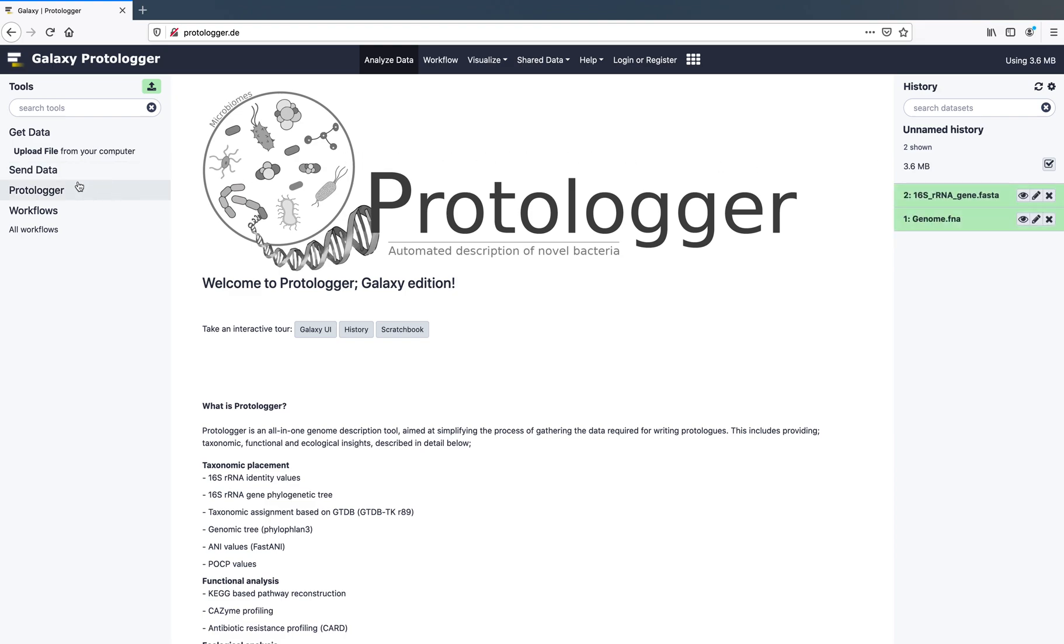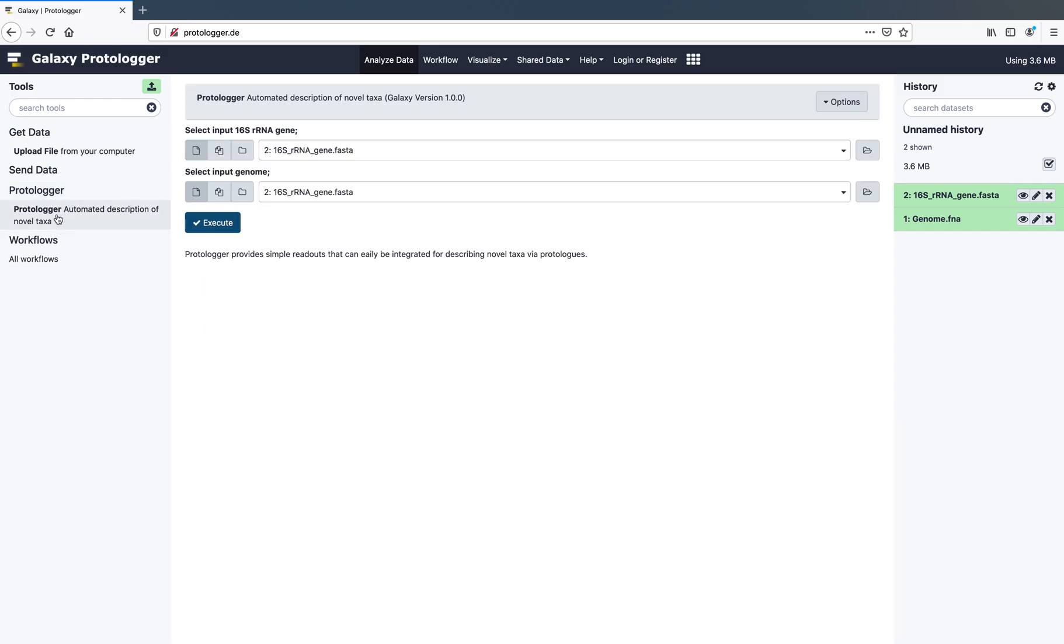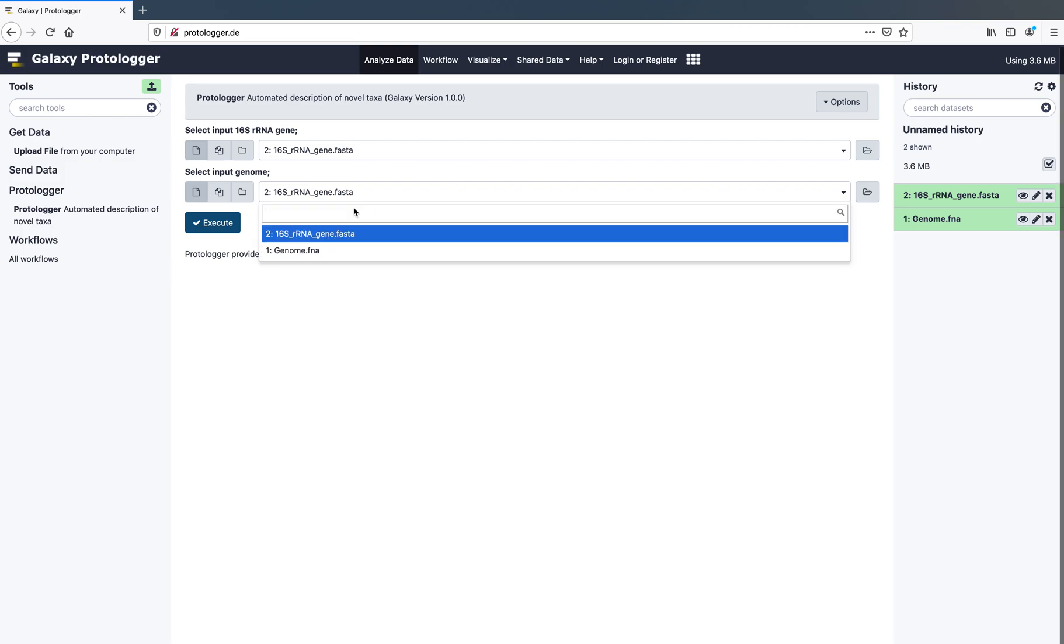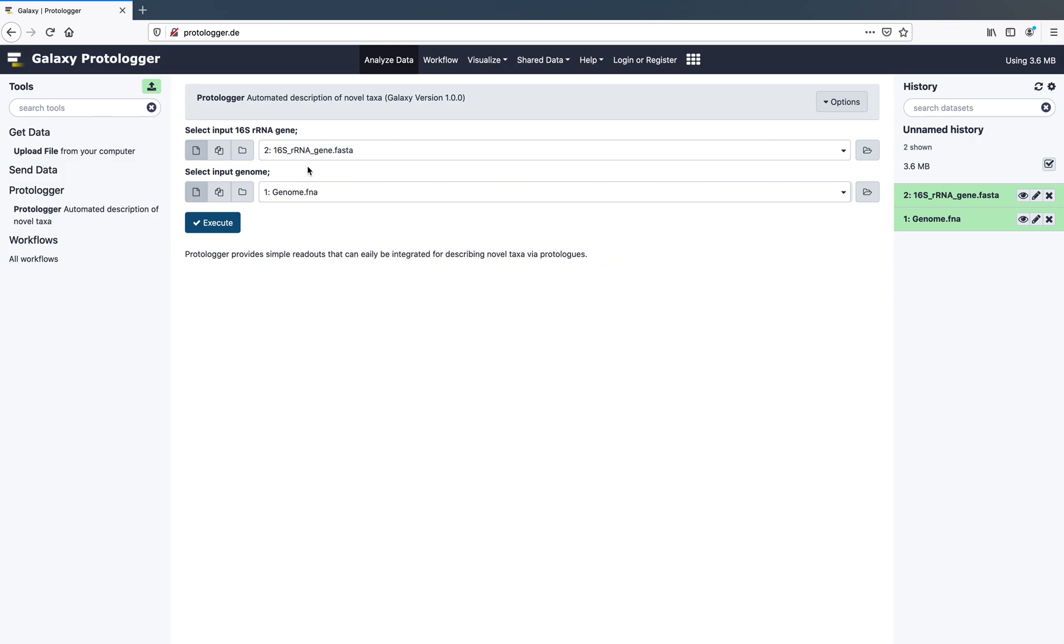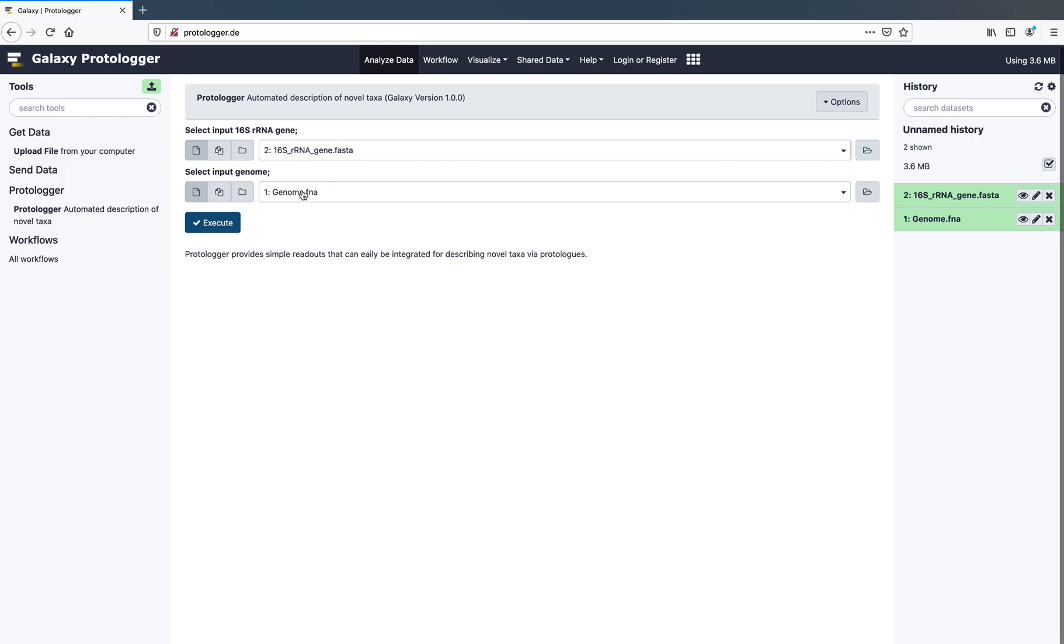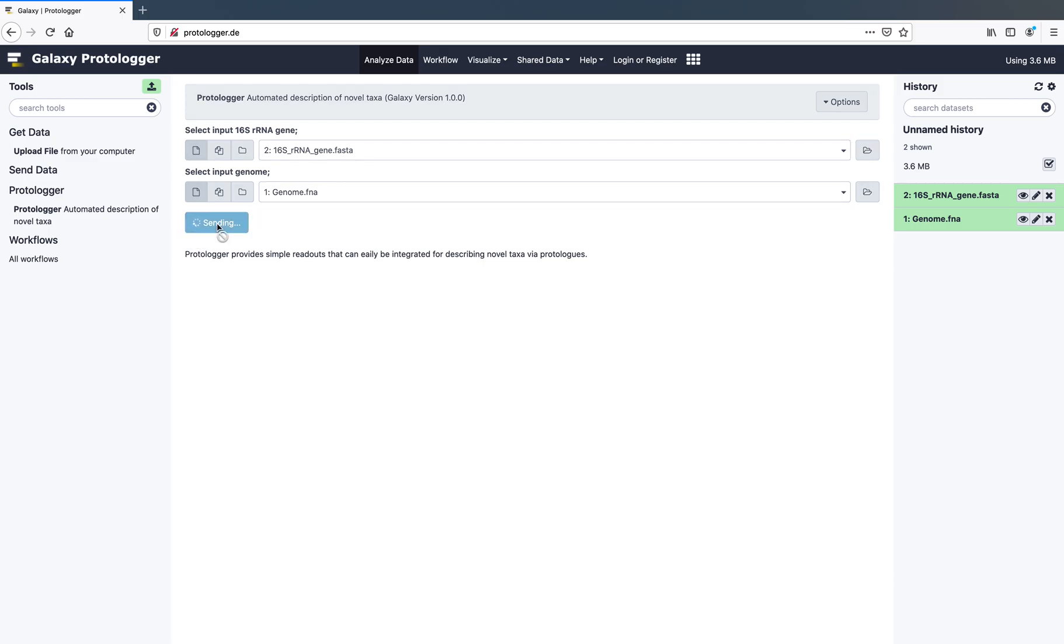Next, on the left-hand side, click on Protologa and select Protologa to load the tool itself. Select your 16S rRNA gene and genome files, making sure they are in the correct input. Click Execute and your analysis will be submitted and the output will appear in the history on the right-hand side.